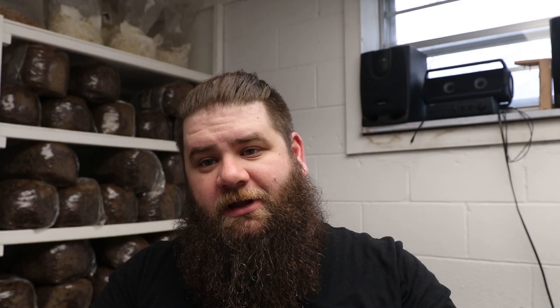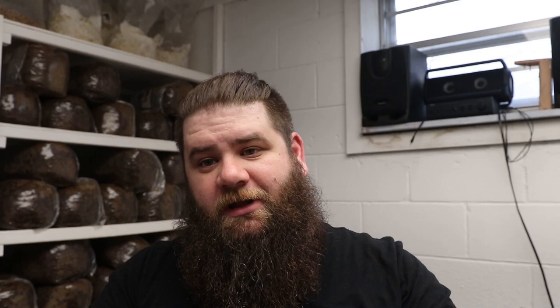Now, the second thing we want to talk about is slants - these culture slants that we made. I actually ran out a little bit of my agar so I've got like two or three of these left. These are not great for work - for one thing you've got to get down in there and work a little bit. It's not great for cleanup work, there's not enough room for mycelium to grow out, and it's not really good for growing up mass biomass.